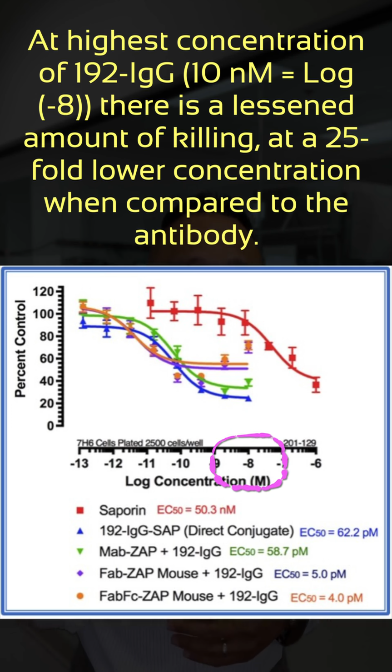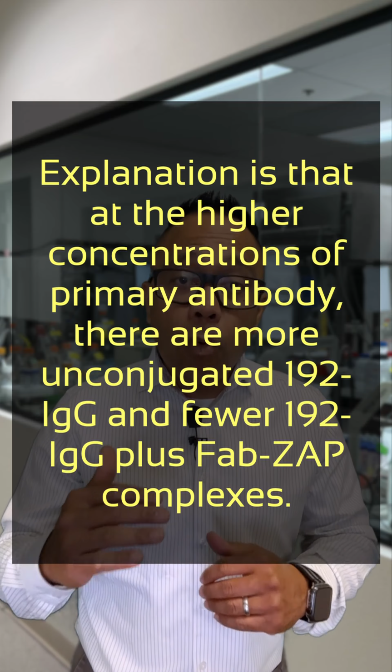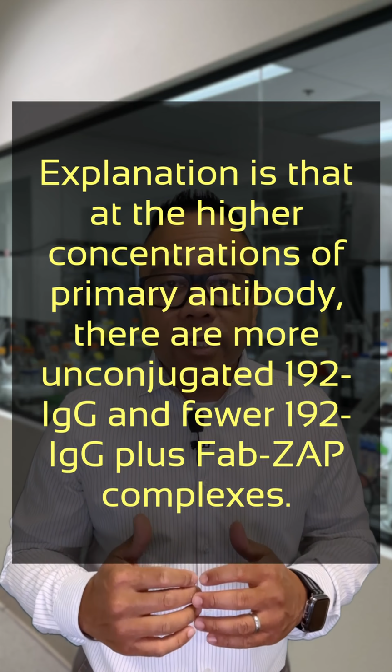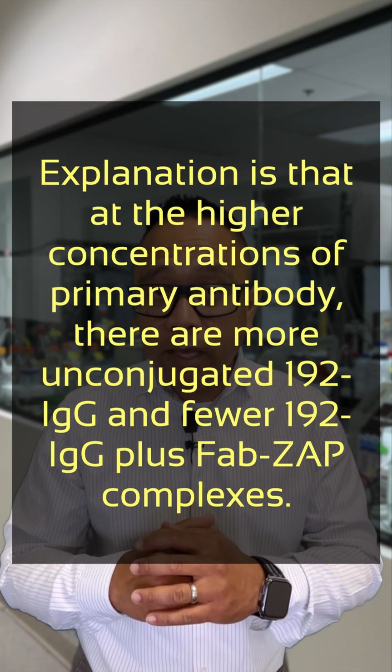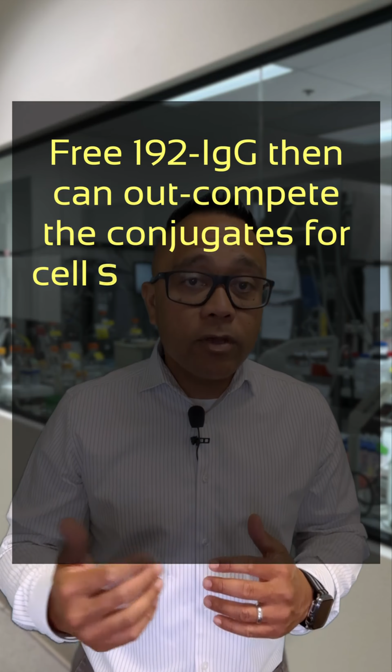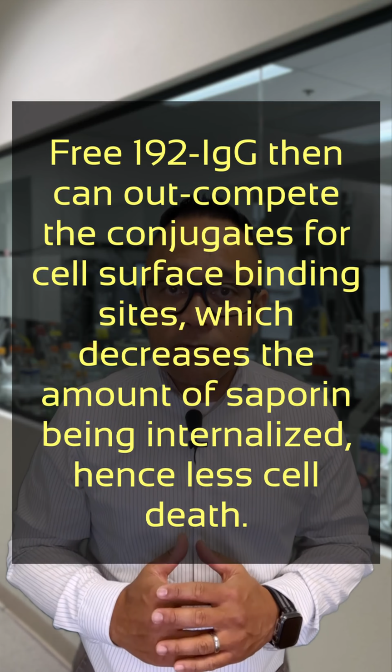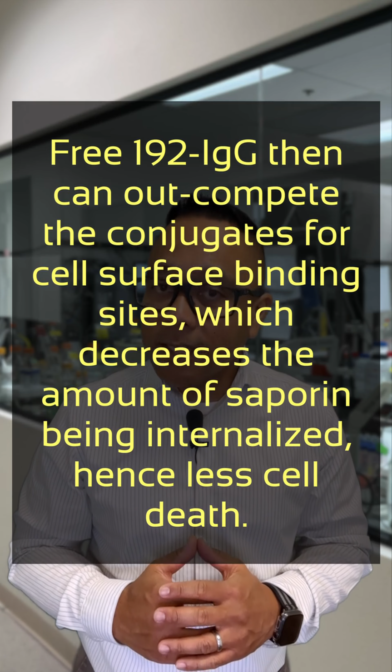Now, the explanation is that at the higher concentrations of primary antibody, there are more unconjugated 192 IgG and fewer of the 192 IgG plus FabZap complexes. So, this free 192 IgG then can outcompete the conjugates for cell surface binding sites, which in turn decreases the amount of saporin being internalized, hence less cell death.